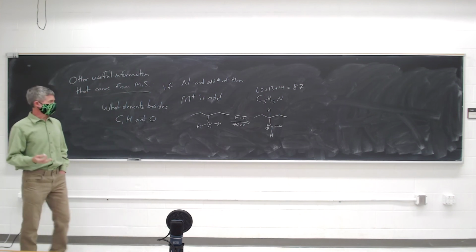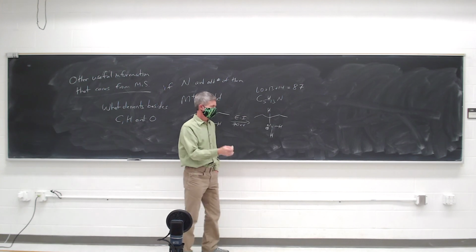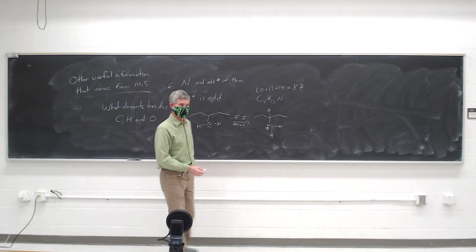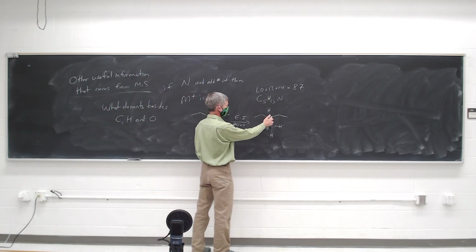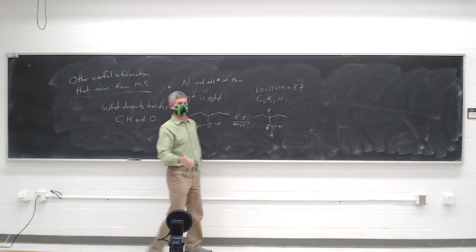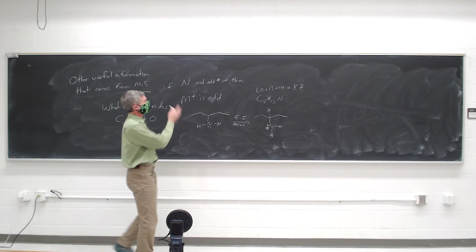So that's an odd molecular ion. Why is that odd? It's because when you put a nitrogen in there, the nitrogen has a valence of 3 and comes with 2 hydrogens rather than 1. When it was an OH group, the oxygen just went in and kept the other hydrogen that it replaced. So the nitrogen adds an extra hydrogen. So an odd-numbered molecular ion often tells you there's nitrogen in your molecule.